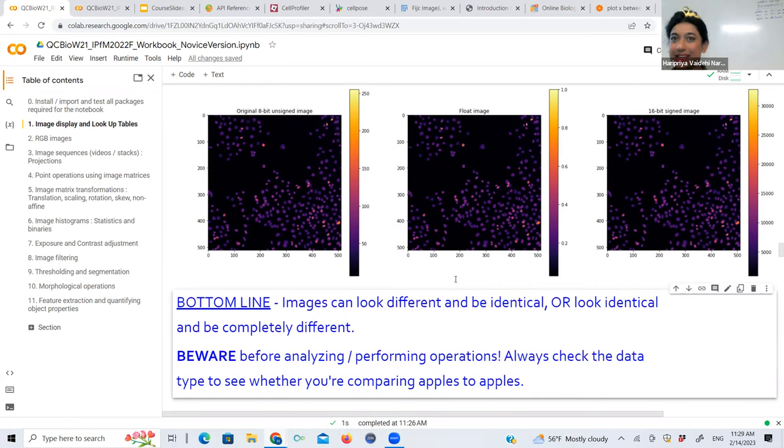Yes, absolutely. Because you've essentially preserved the ratio, right? Like if this pixel is 7 and this is 255, you preserve that ratio in the second or the third image, even though the actual numbers are different. So as long as you preserve the ratio, you're good. Okay, that makes sense. Thank you. Because everything is relative. You're never counting the absolute number of photons anyway. Correct. So whatever you do on the relative scale is fine.